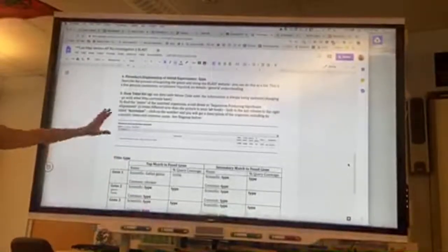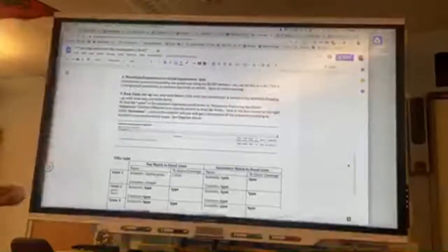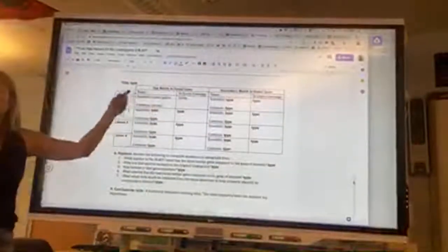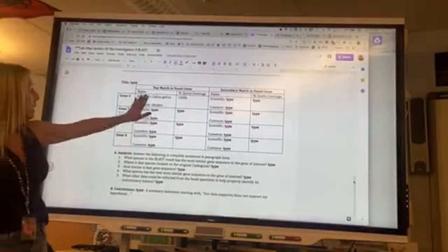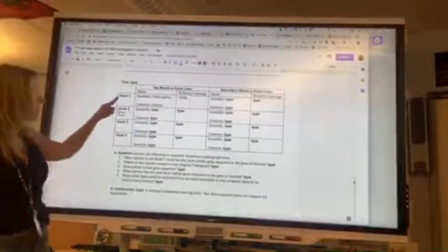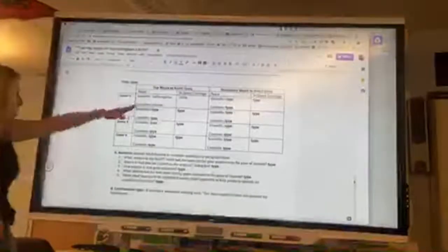Okay, your data table, I've already set it up for you, but there's information here you want to pay attention to in order for you to analyze the data. If you bypass that, you won't get the right thing you need. And this BLAST lab, this may actually not be true anymore, because they always get new information in it and it's updated, but at the time I typed the lab map, that was true. But you're gonna give the scientific name and the common name chicken and how close it is to, this was gene 1. At the time when I ran it, gene 1 was closest to similarity with the chicken. Okay, so you're going to do that for all those.